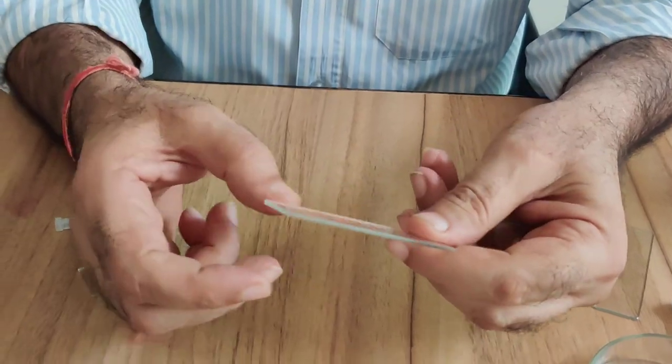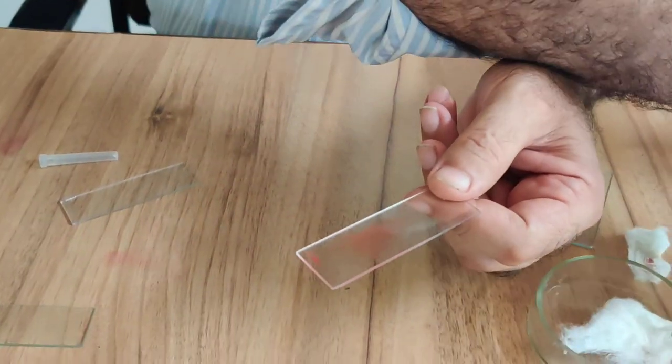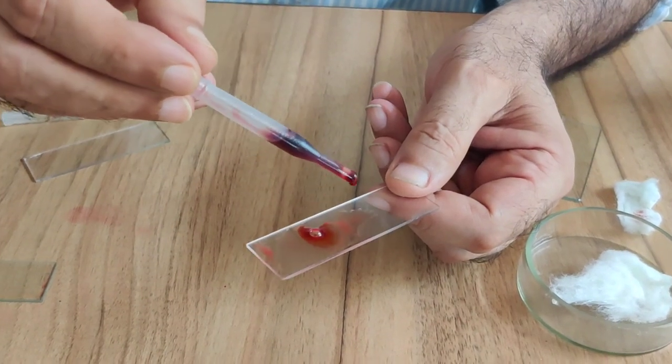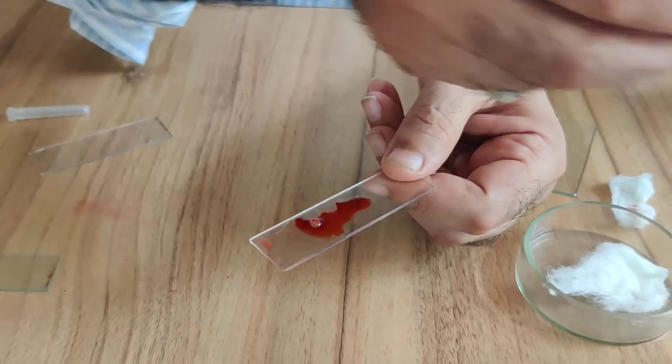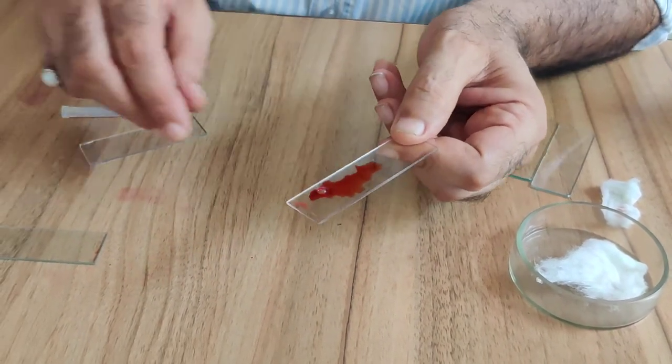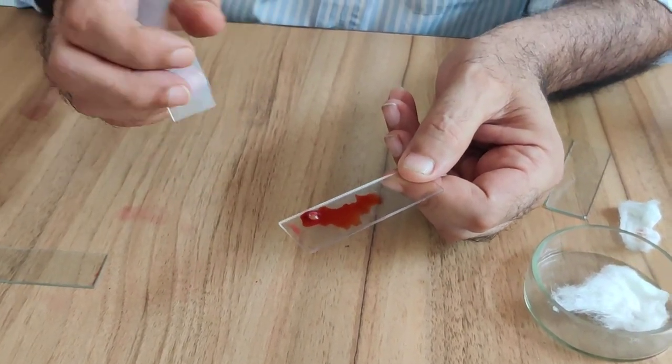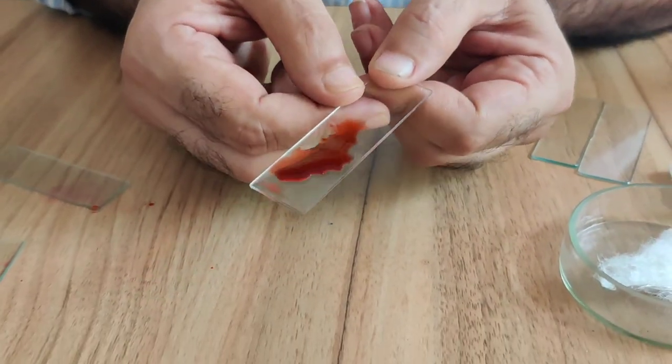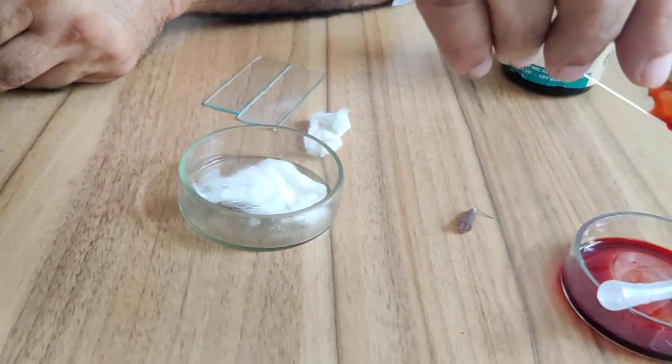Make it somewhat dry. Put a few drops of Leishman's solution here. Make it dry. Remove the bubble. Then remove the extra stain.